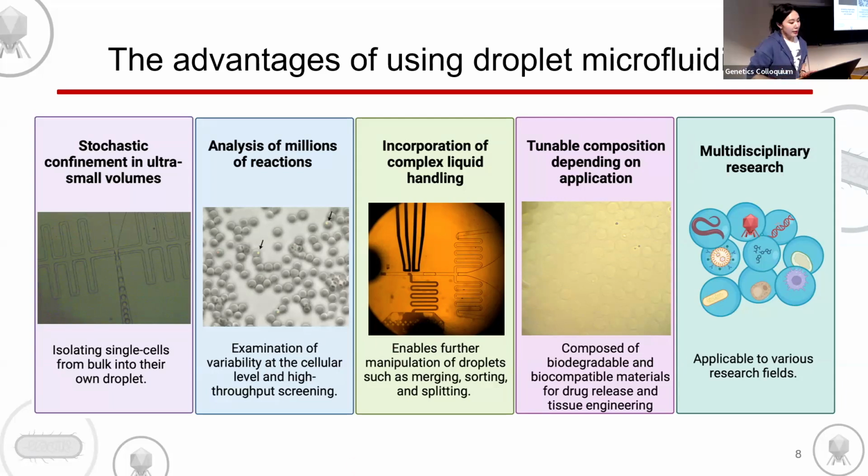In addition, it could handle incorporation of complex liquid handling. So this here is a video where you could actually inject reagents. So if you want to add a reagent that you don't want in the reaction mix before, you could actually add it in the middle of your experiment during droplet microfluidics.